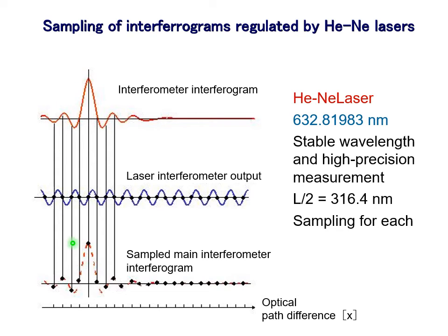The interferogram thus measured is Fourier transformed to obtain a spectrum. The wavelength of the helium neon laser is determined with high accuracy, and the oscillation wavelength is very stable. Since the wave number is calculated based on the wavelength with high accuracy as described above, the wave number accuracy of the spectrum measured by FTIR is extremely high.